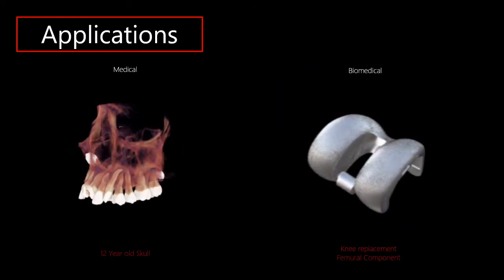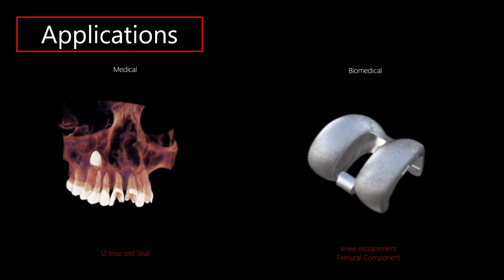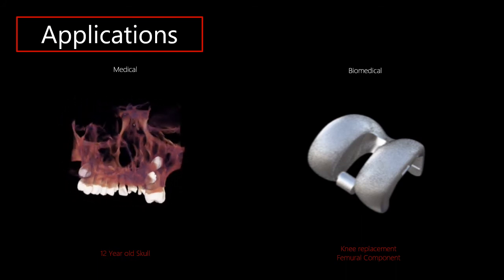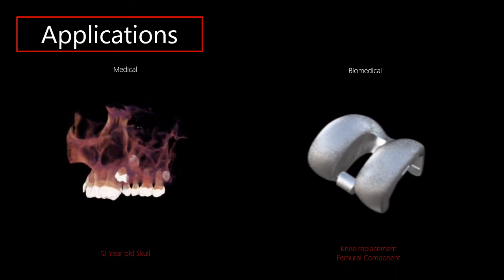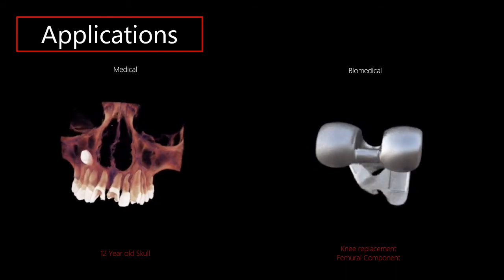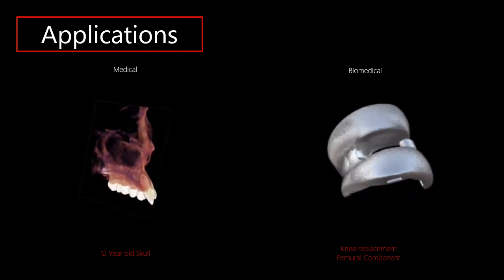For medical applications, this is an example of a 12-year-old skull. And next is a knee replacement femoral component for biomedical applications.